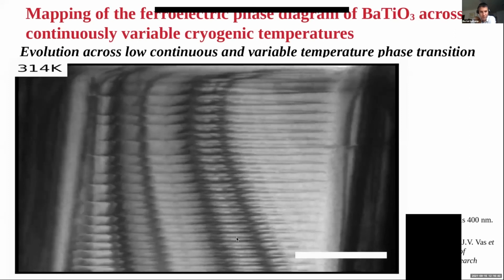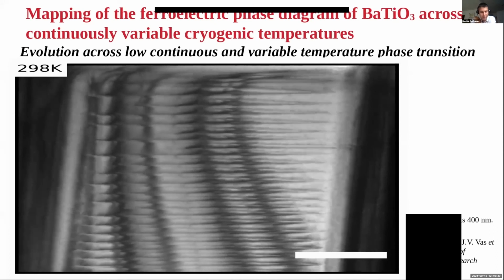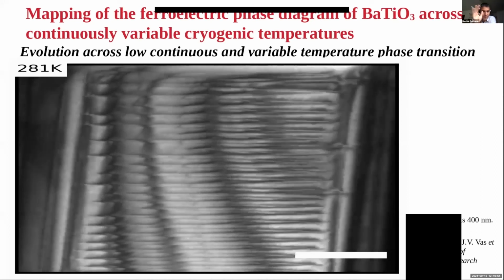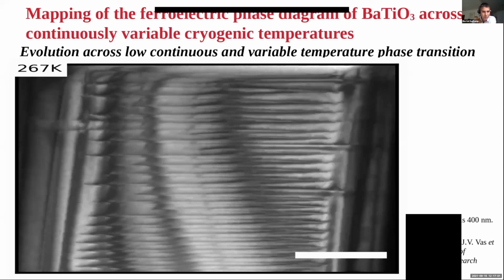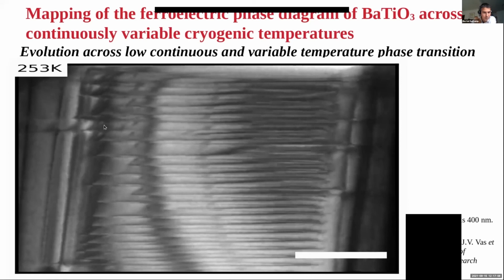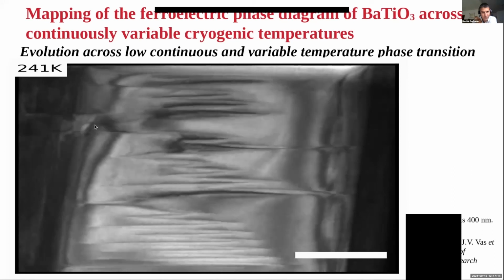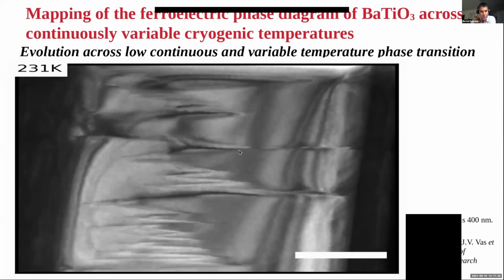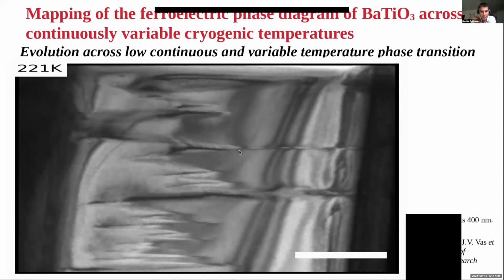you have this new tetragonal 180-degree domain phase. And now we keep going down in temperature until we reach the orthorhombic phases. You can also notice that the bending contours are moving a bit, so we have some change in tilt, and we can already see on the top left-hand side a change of the configuration. We are starting to go into the orthorhombic phase, and now we are fully in the orthorhombic phase. You can see that the domains are less defined because they are not in a 001 direction, but in a 110 direction. So we just see a projection of this ferroelectric polarization.